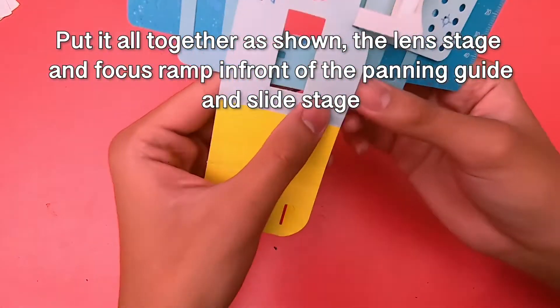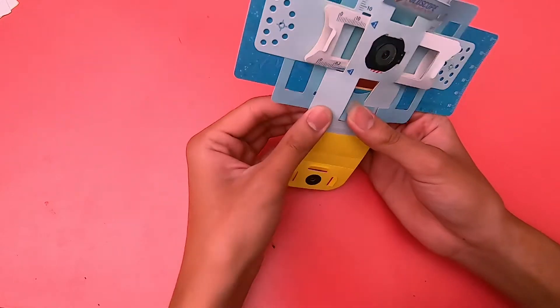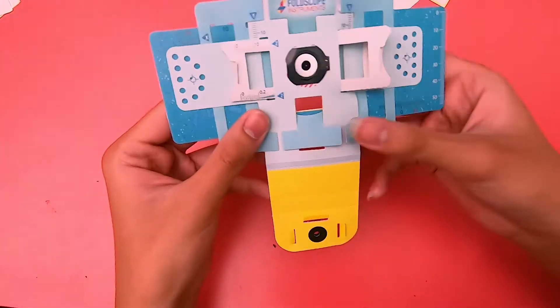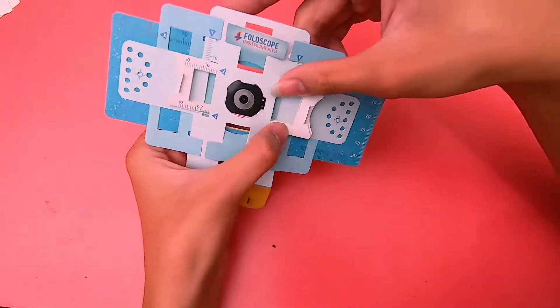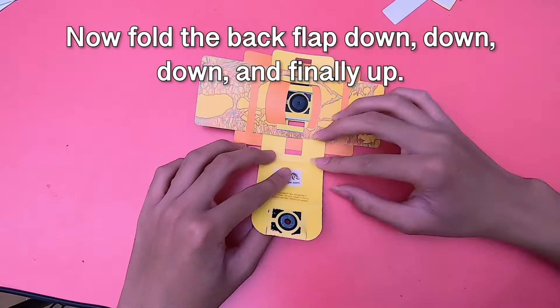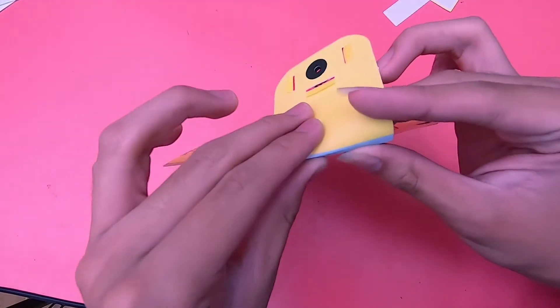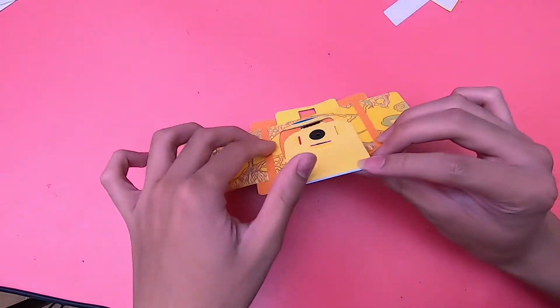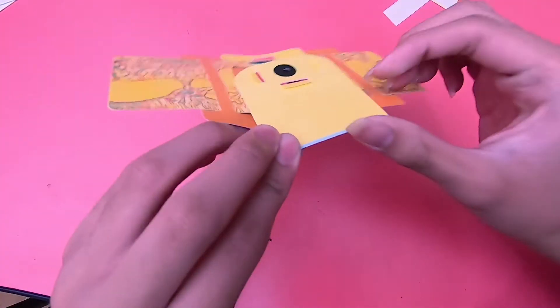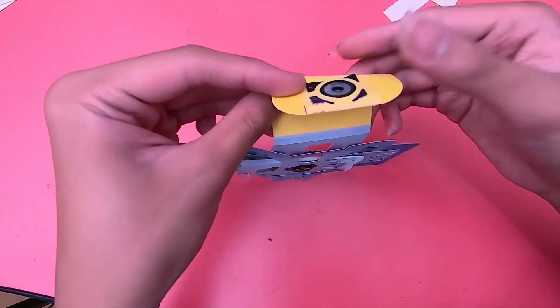Flip it! Fold it down, then fold it down again. So you have to fold it down three times, then fold it up.